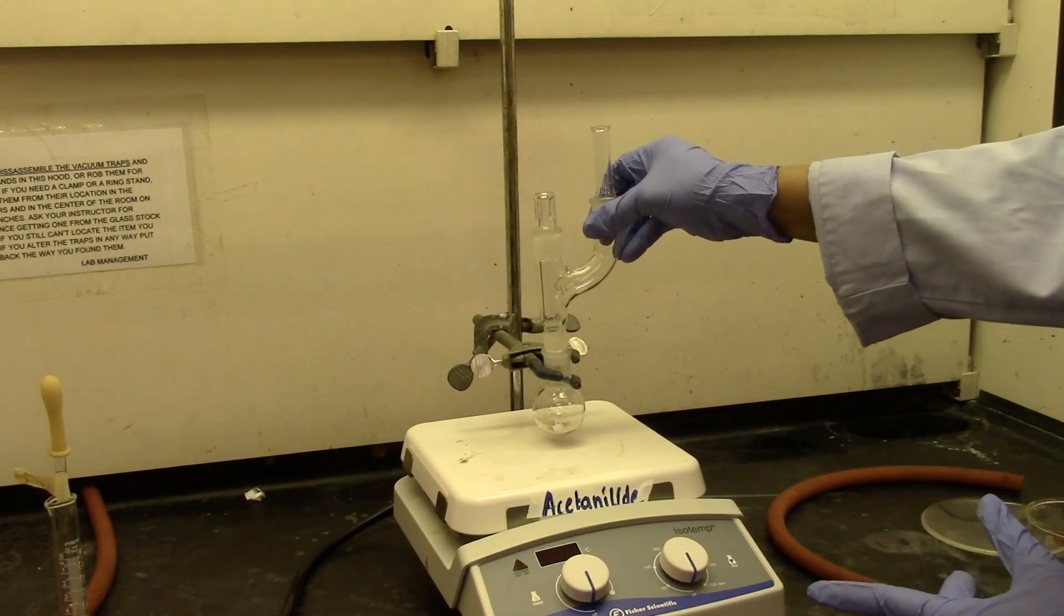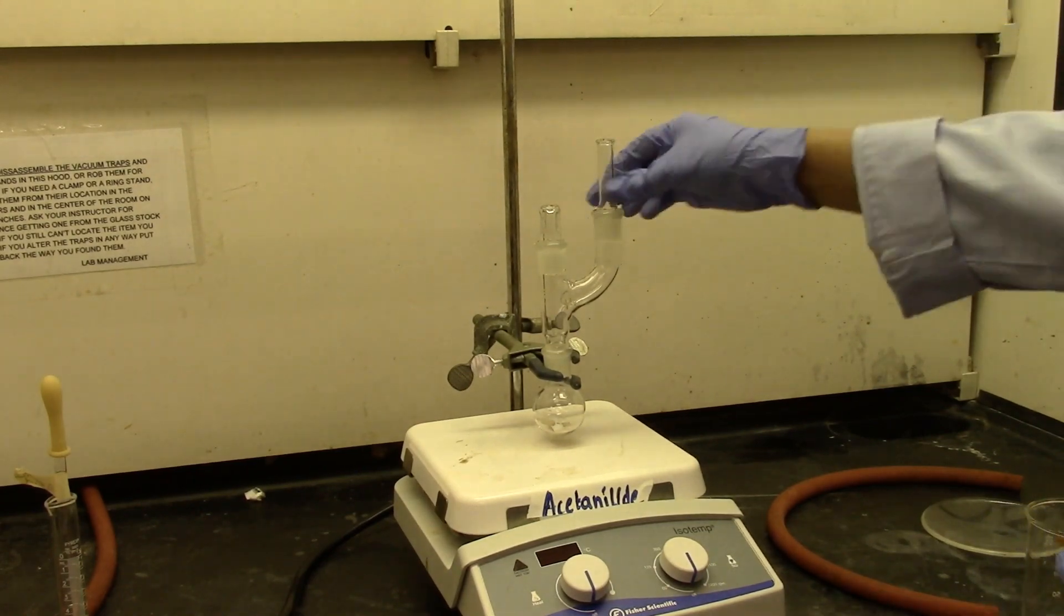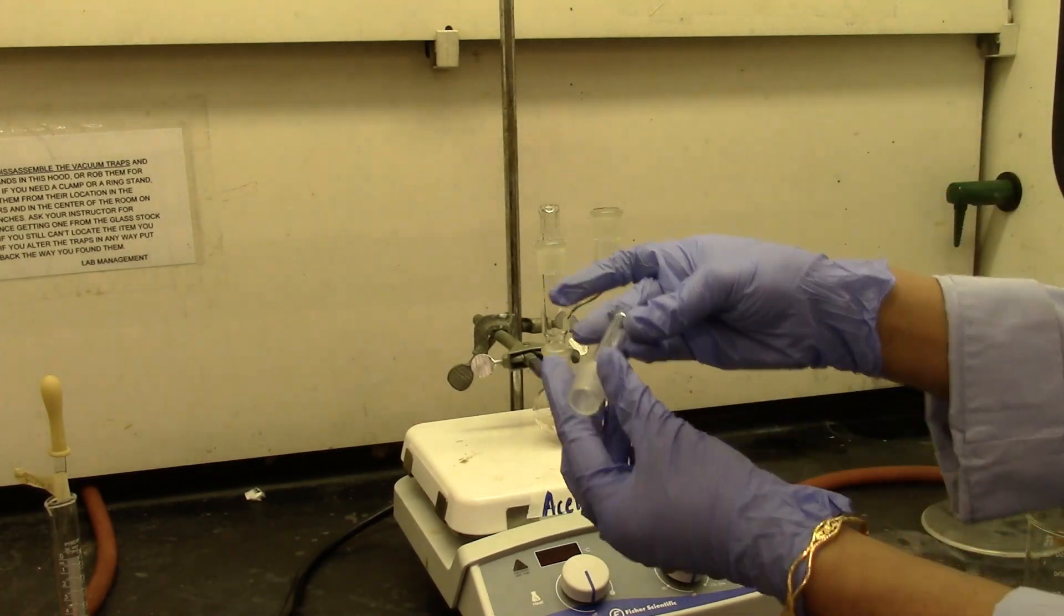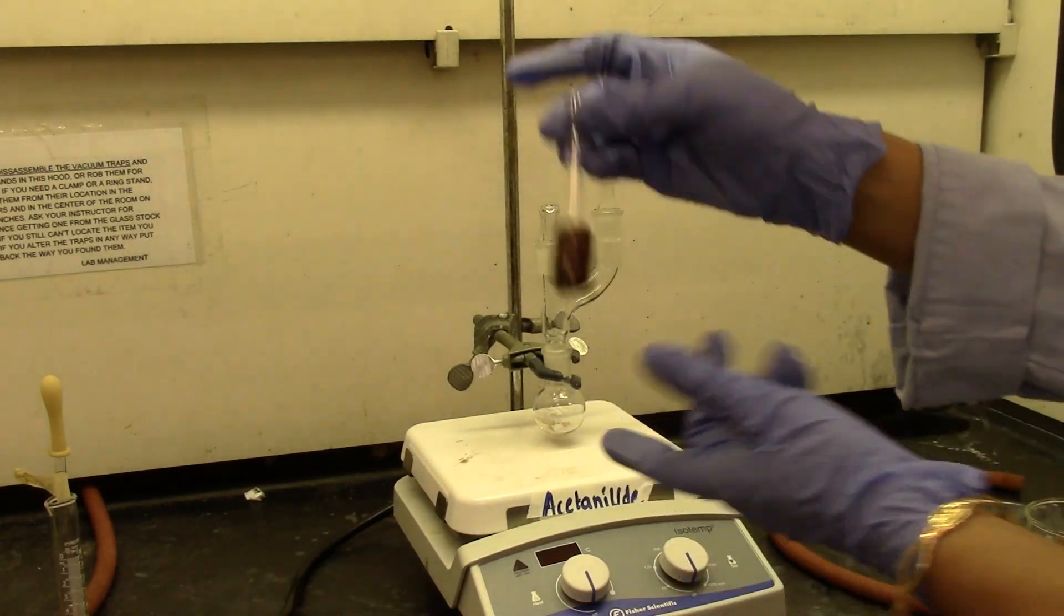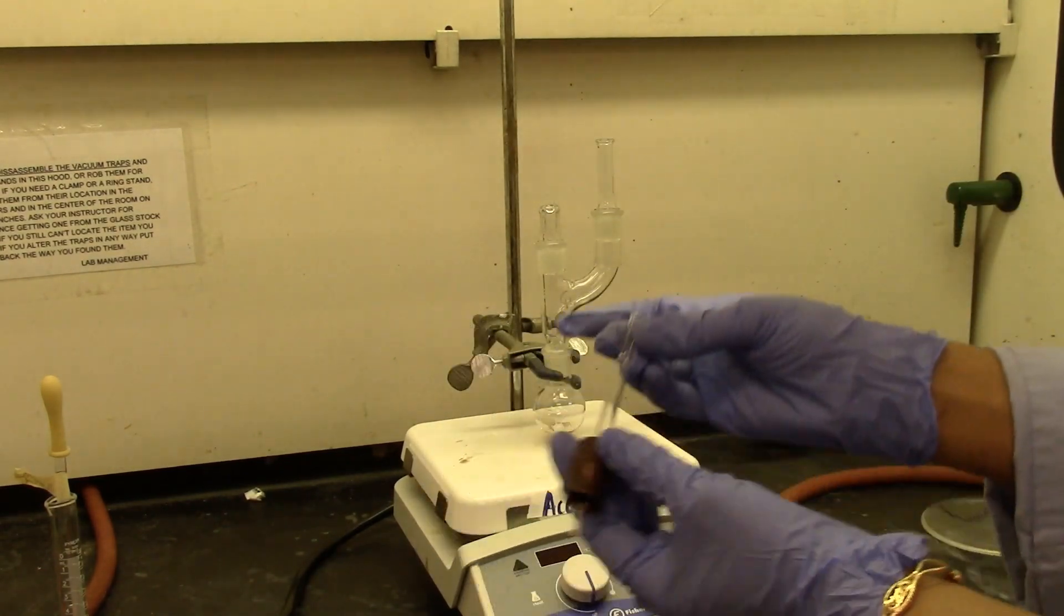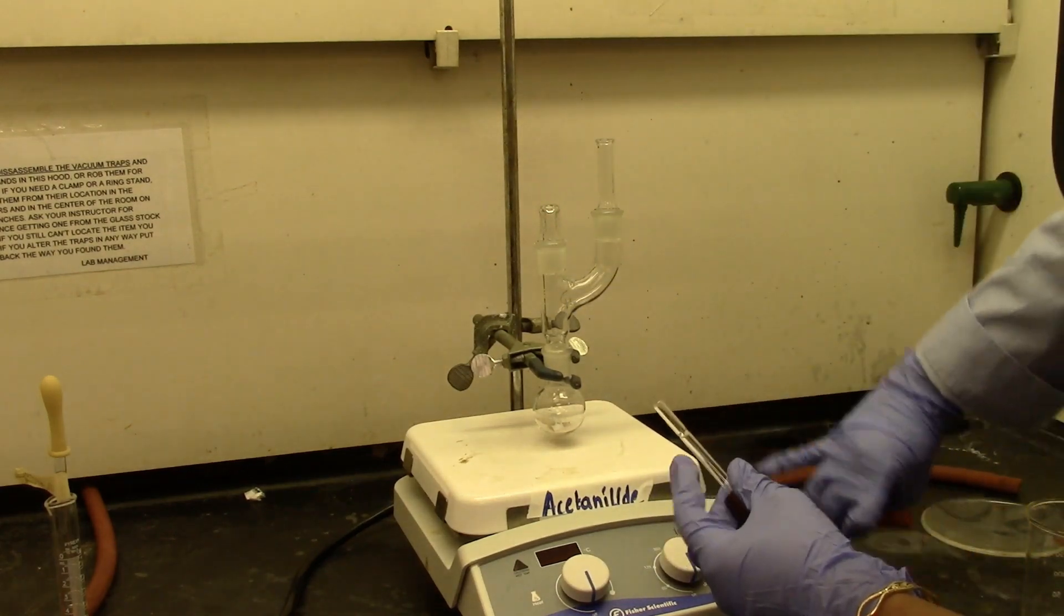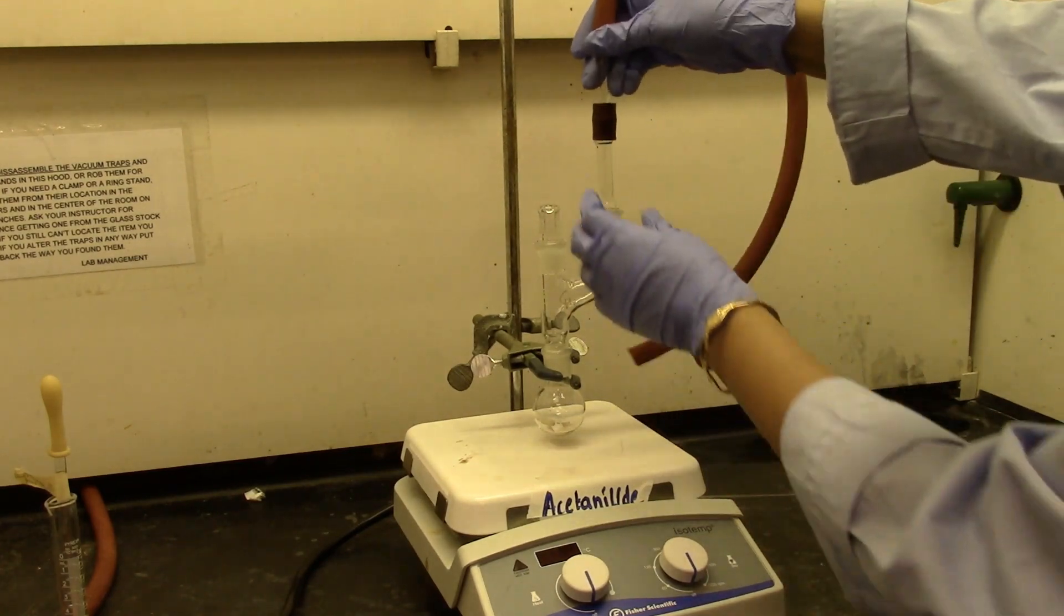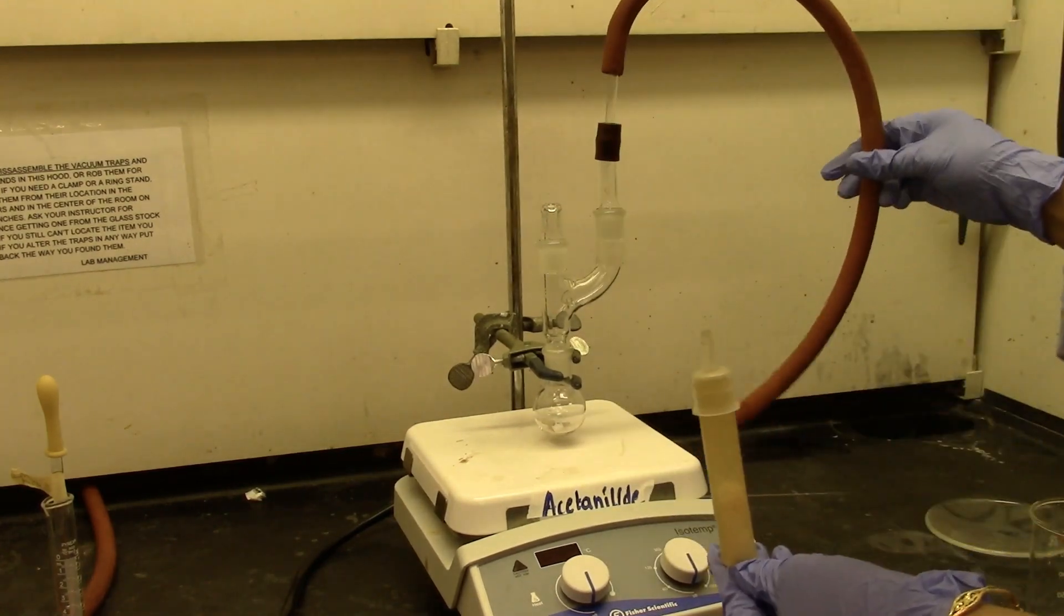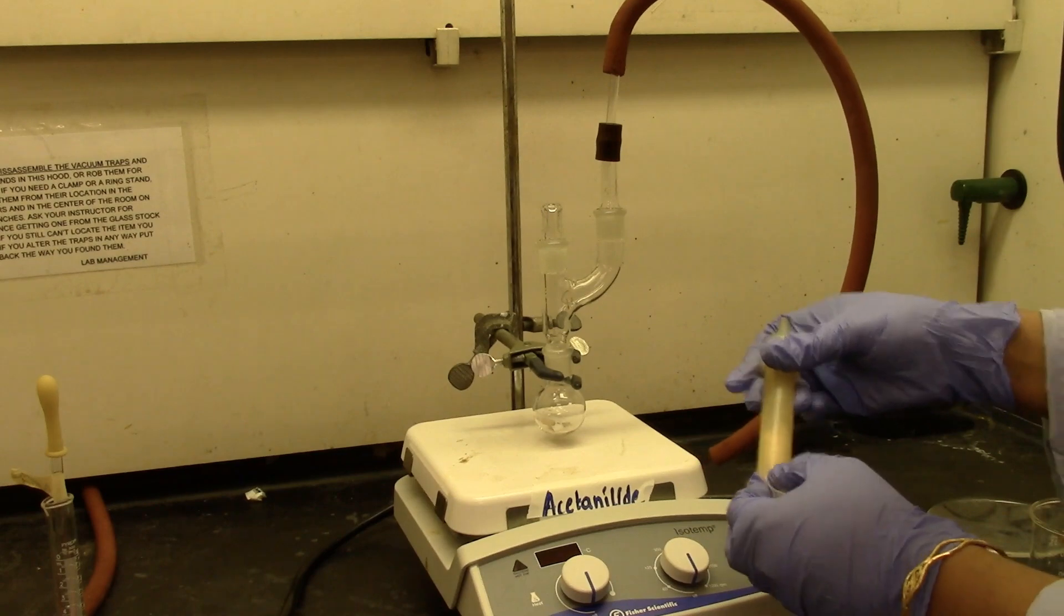So with the Claisen head that goes on top, and this is a thermometer adapter, using this, I'm going to use a glass insert, just like this, and attach a tubing which goes on top here.